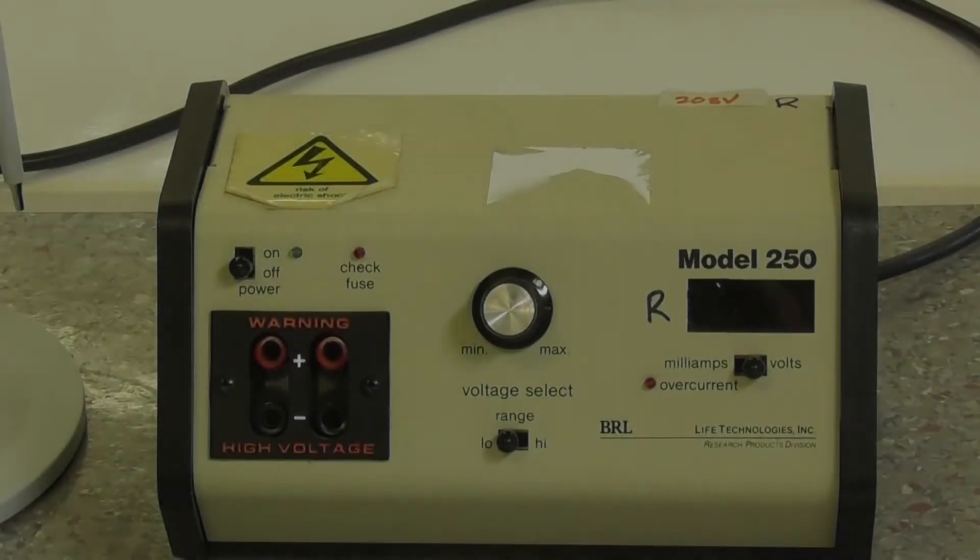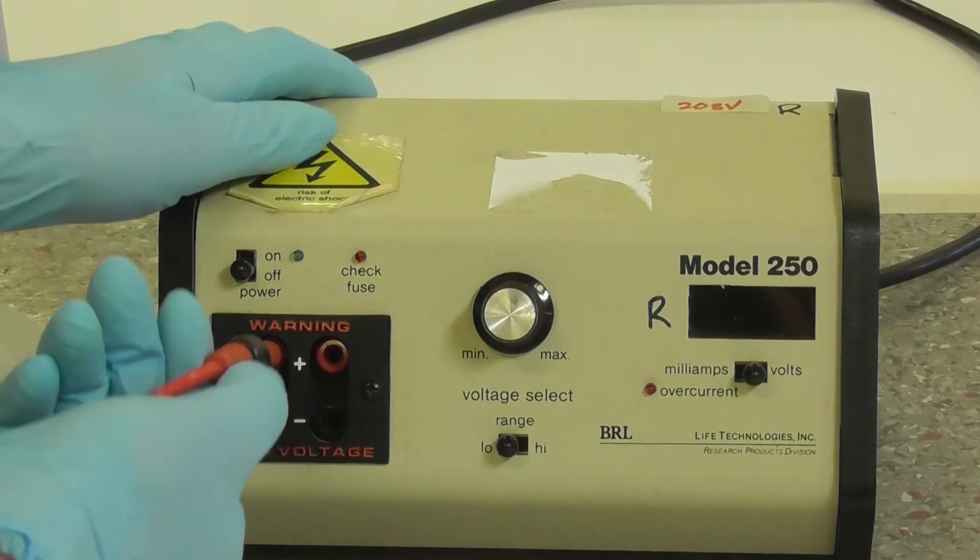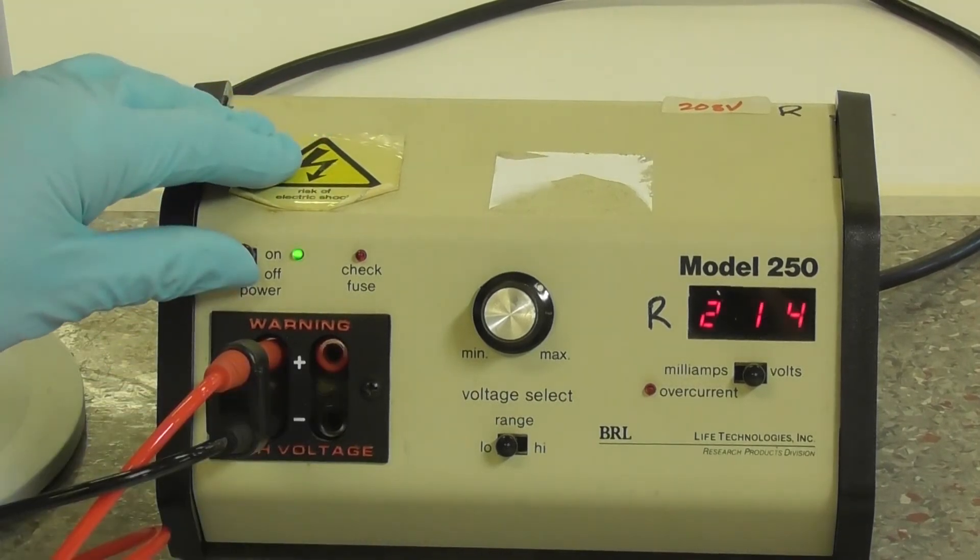Connect the electrophoresis unit to the power source ensuring black connects to black and red connects to red. And then switch on.